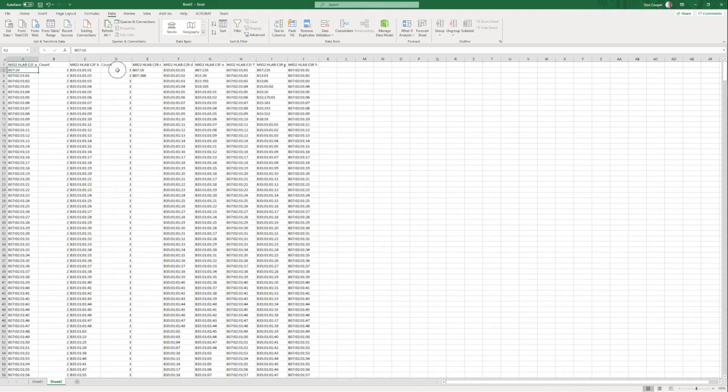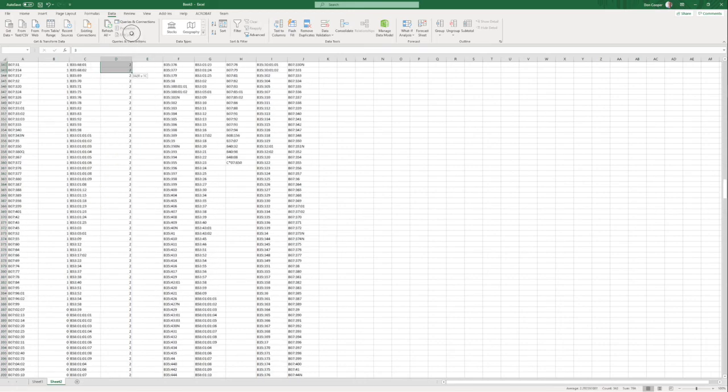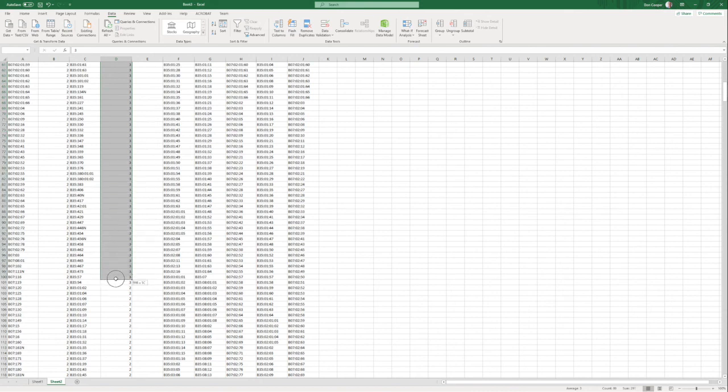But for the other consensus that we got for exon 2 forward, we still have, oops, too far. Always goes down faster than it goes up. You overshoot. We still have 100 potential alleles that we saw 3 times. So we'll cover how to deal with that in the last of the videos. Thank you.